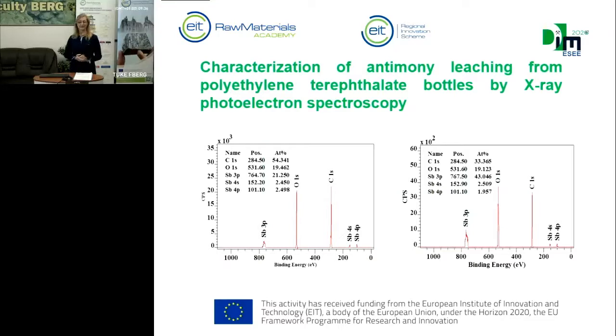You will see it in this picture. You can see that by the XPS method we confirmed the presence of antimony on the surface of the drinking bottles.